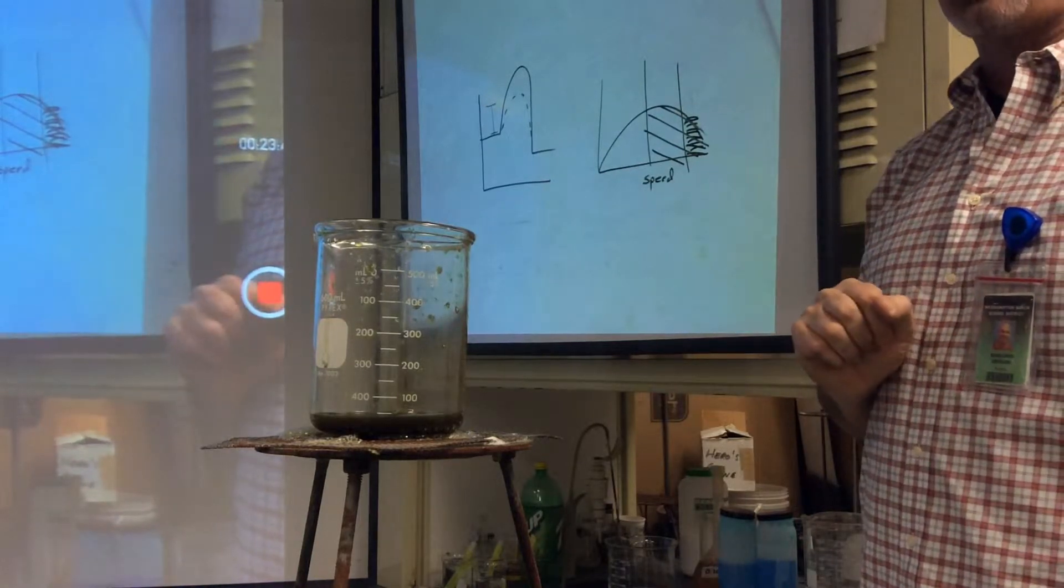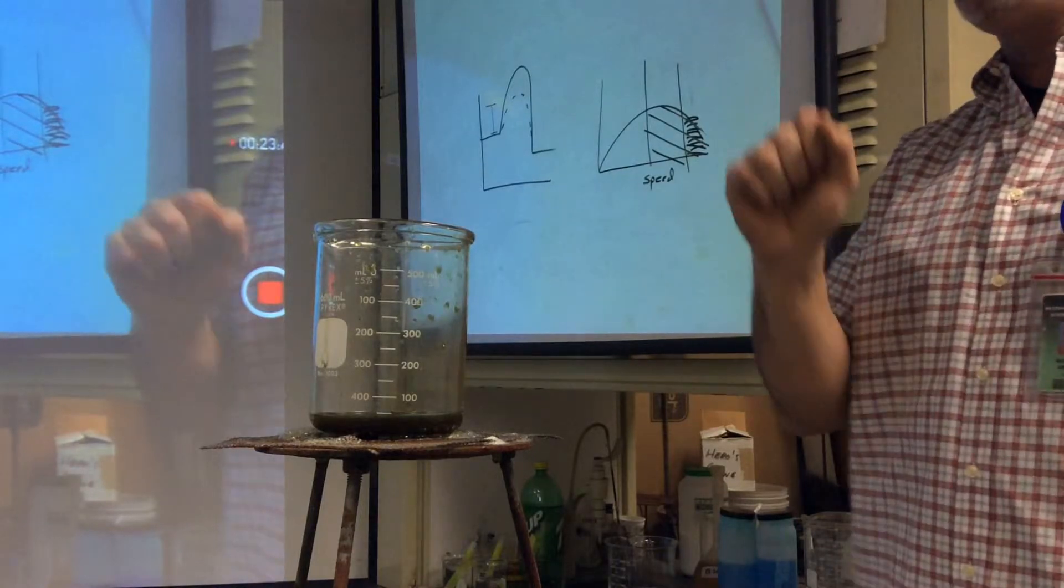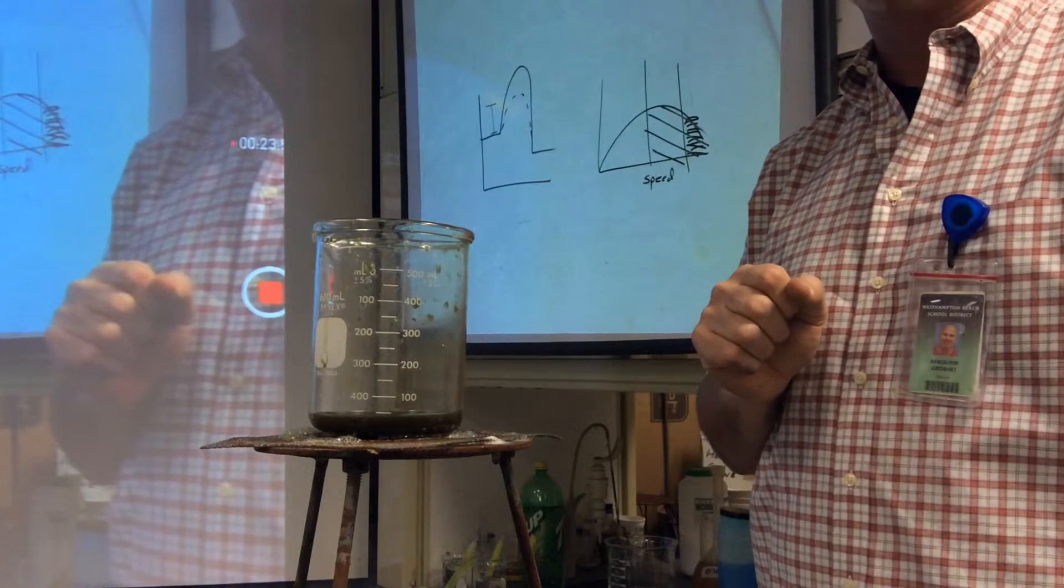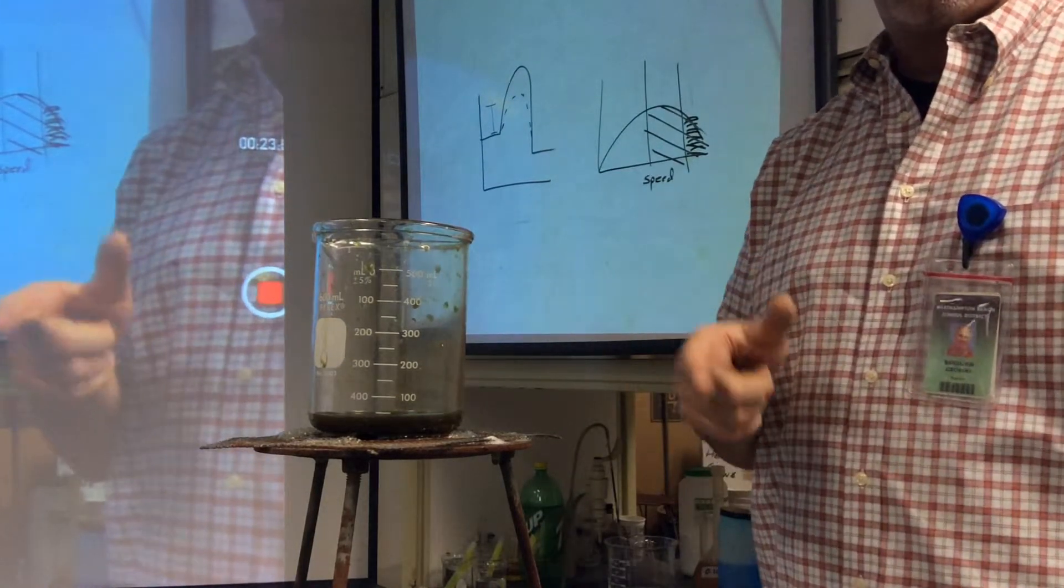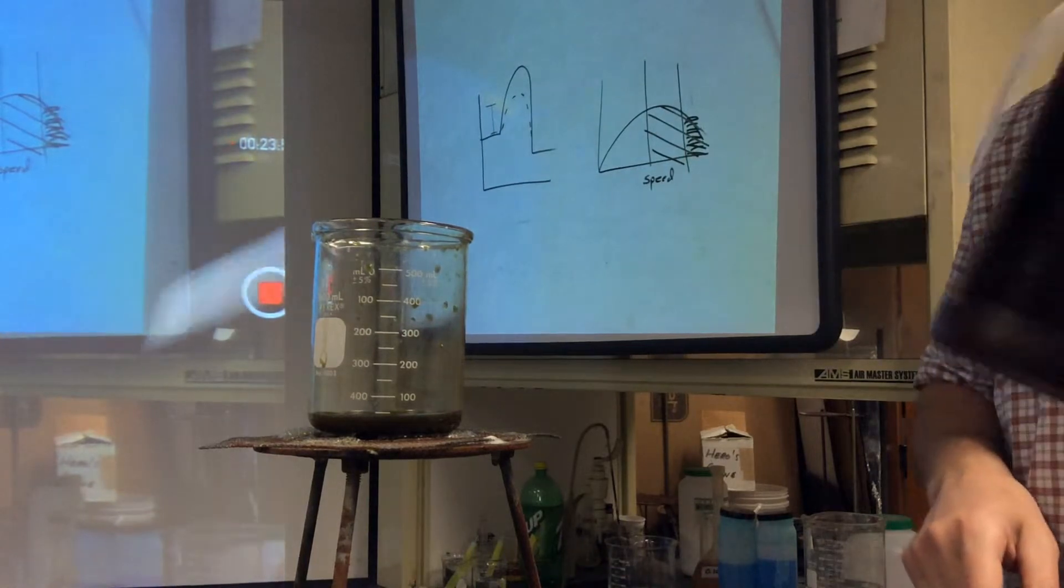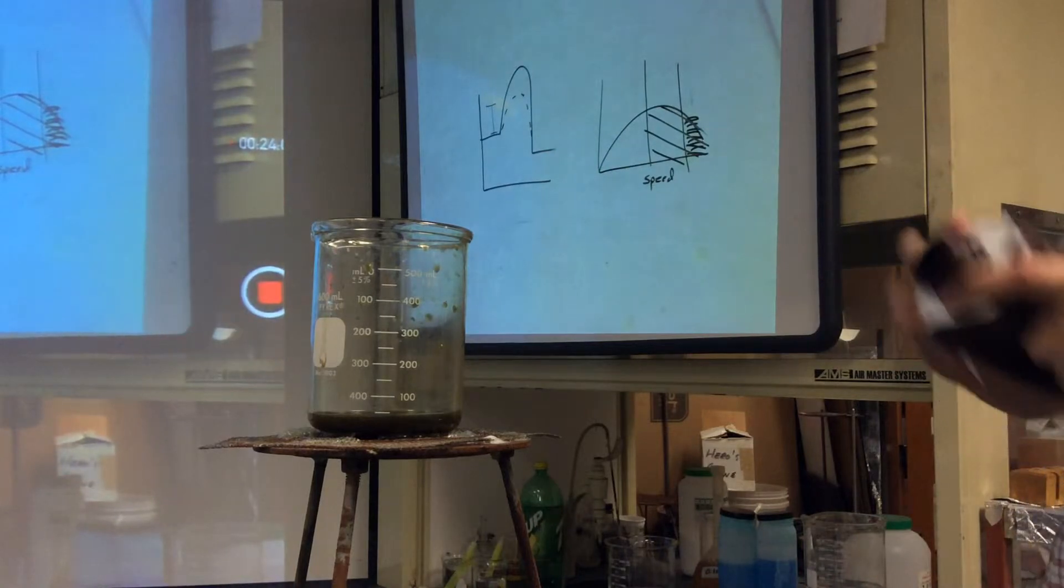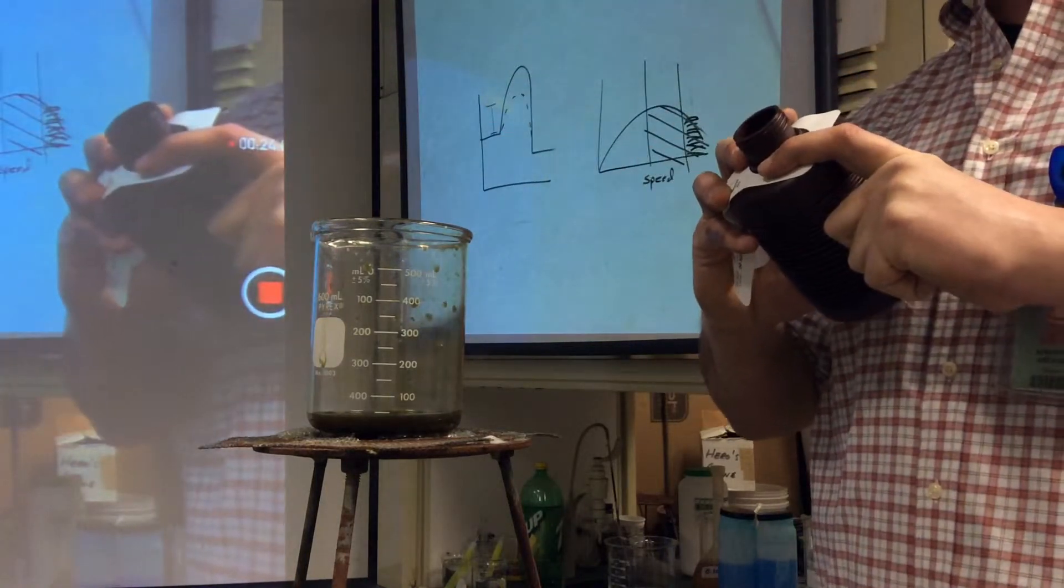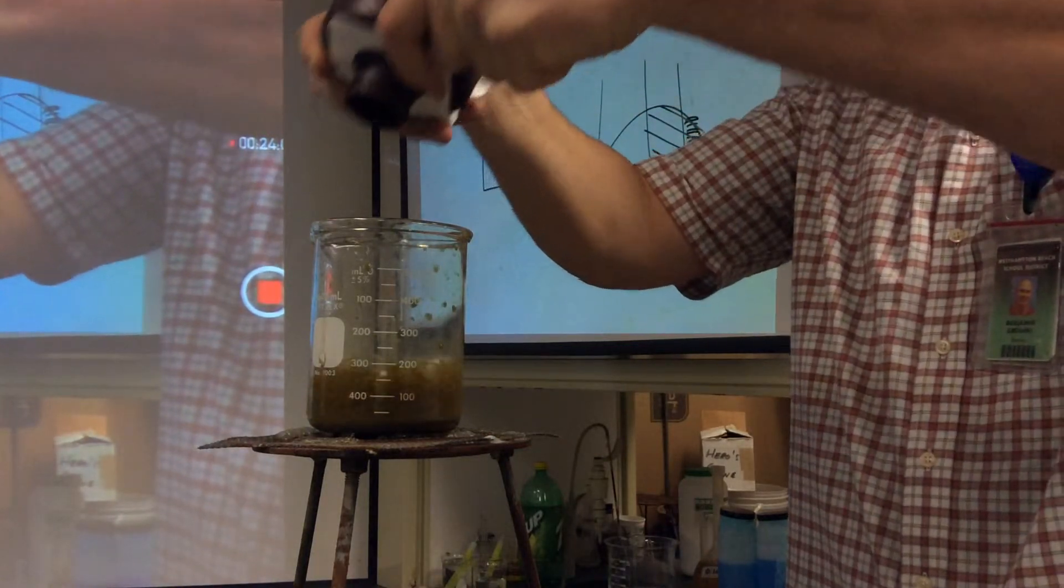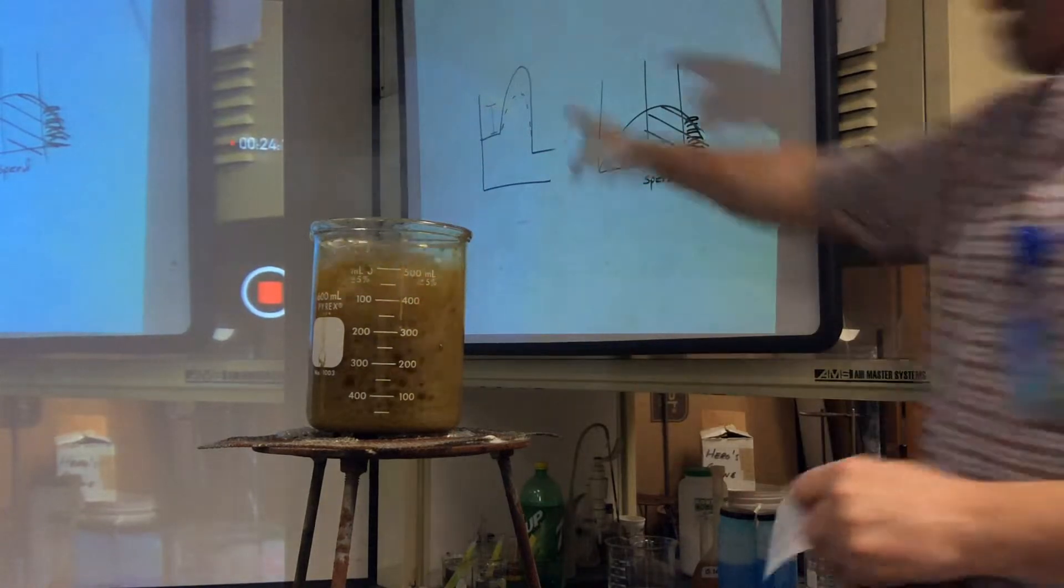Now how do I know I added an activation energy? Well, you learn in sixth grade that catalysts never get consumed in a reaction. So theoretically, all I have to do is add more reactants and this should start up again. But if the catalyst doesn't get consumed, it still should be there. And it is! Oh, there's our green monster again. There we are.